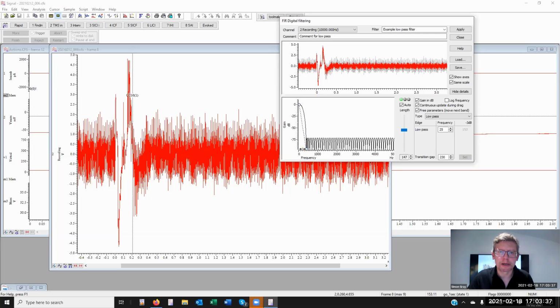Okay, so perhaps I might use an IIR filter for this work, which will give me much more control, but has the disadvantage of possibly moving peaks and troughs. And so if you're measuring between a stimulus time and the peak or trough, then the measurements can be out because of that filter shift.